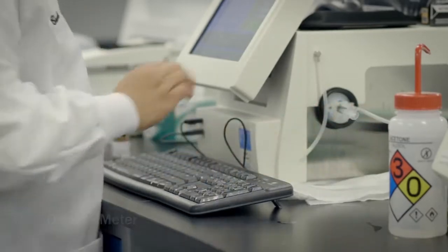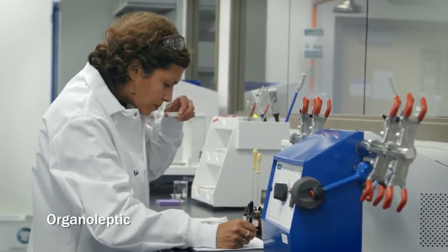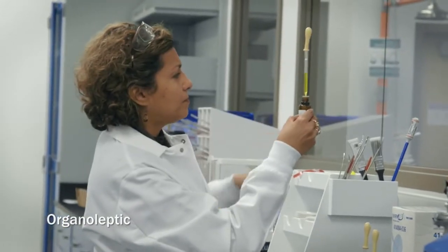The other piece to the physical testing that we do is the organoleptics. Each oil is unique and it has a specific appearance and aroma and color, and we document those at every receipt of all the samples that we receive. And that is part of our release criteria for each oil.